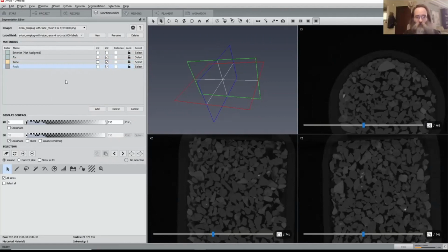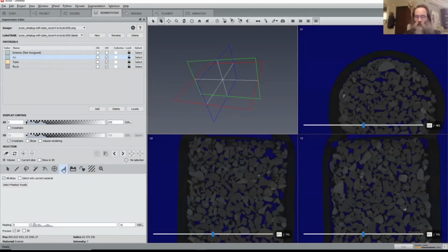So now what we want to do is create the markers for the watershed algorithm. We saw that for the air and for the rocks, thresholding actually works, and we can do that here as well. So you see here is a list of algorithms you can now use to select voxels for the different materials. So we say, for example, we select the air, and we use thresholding.